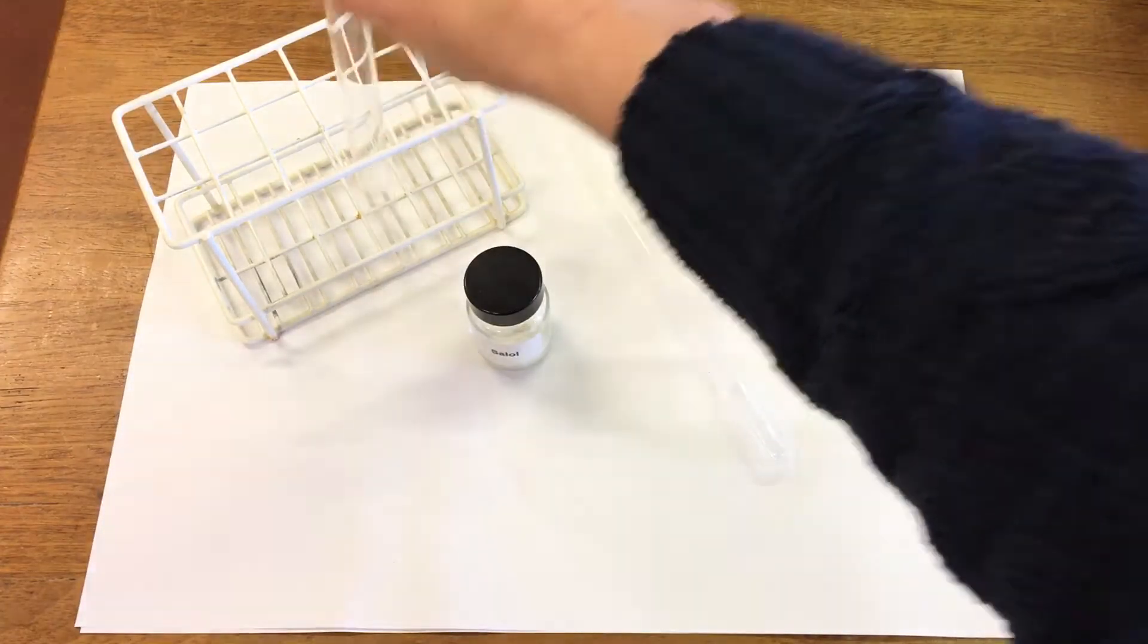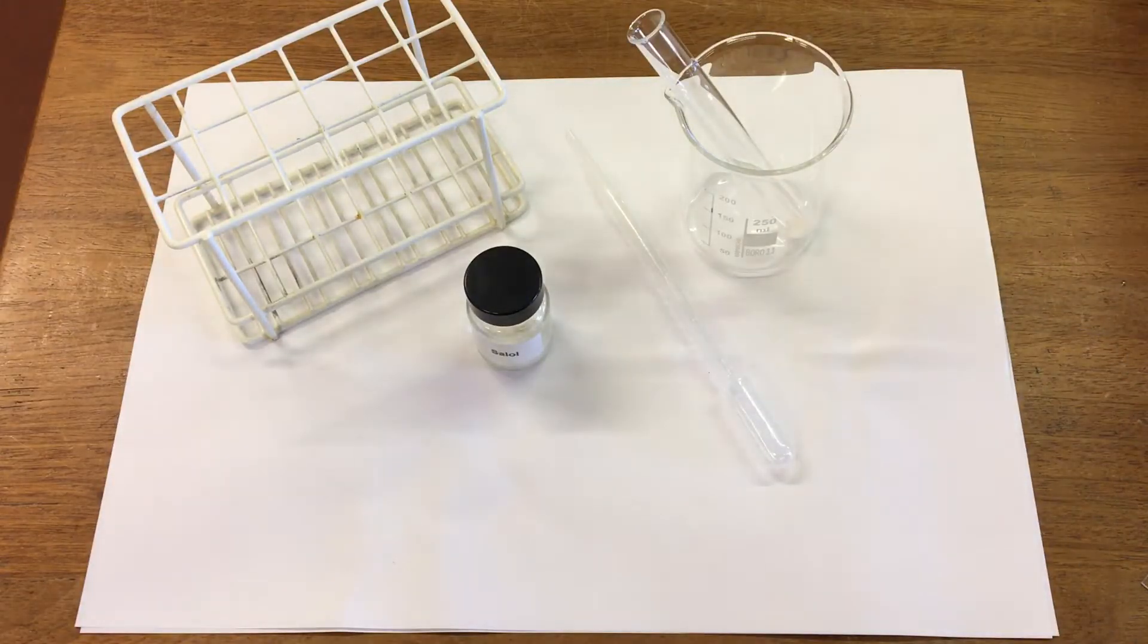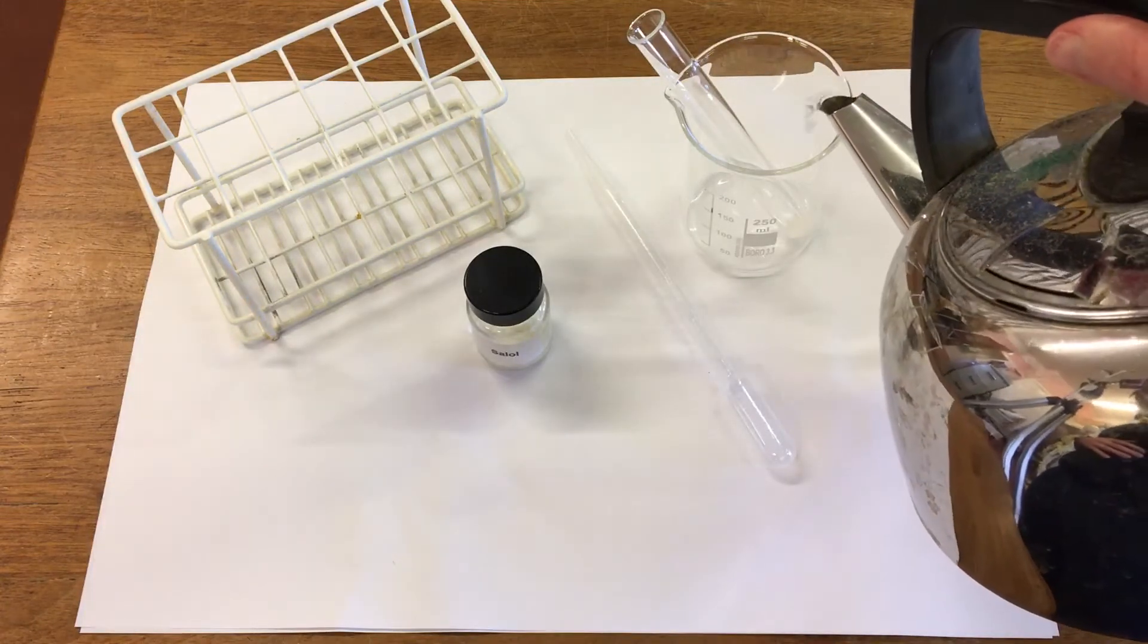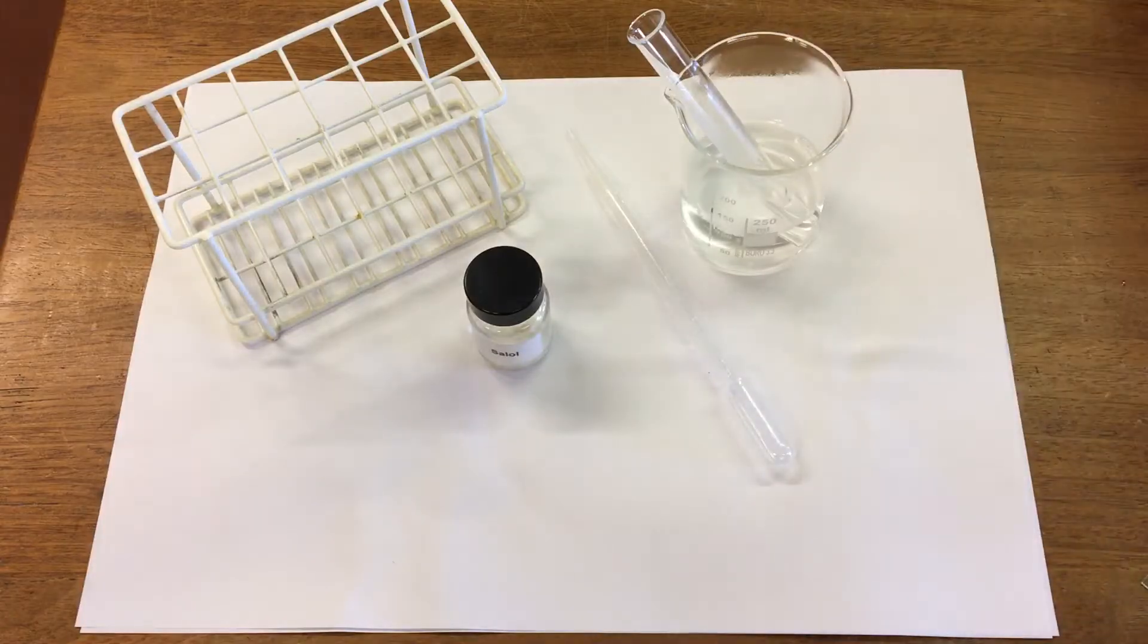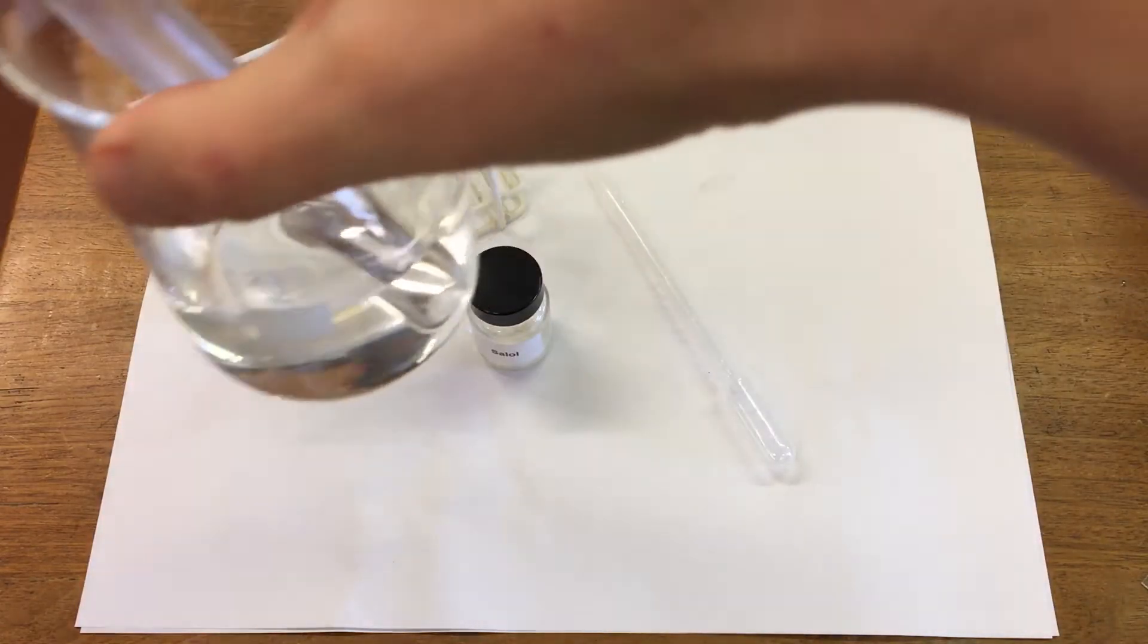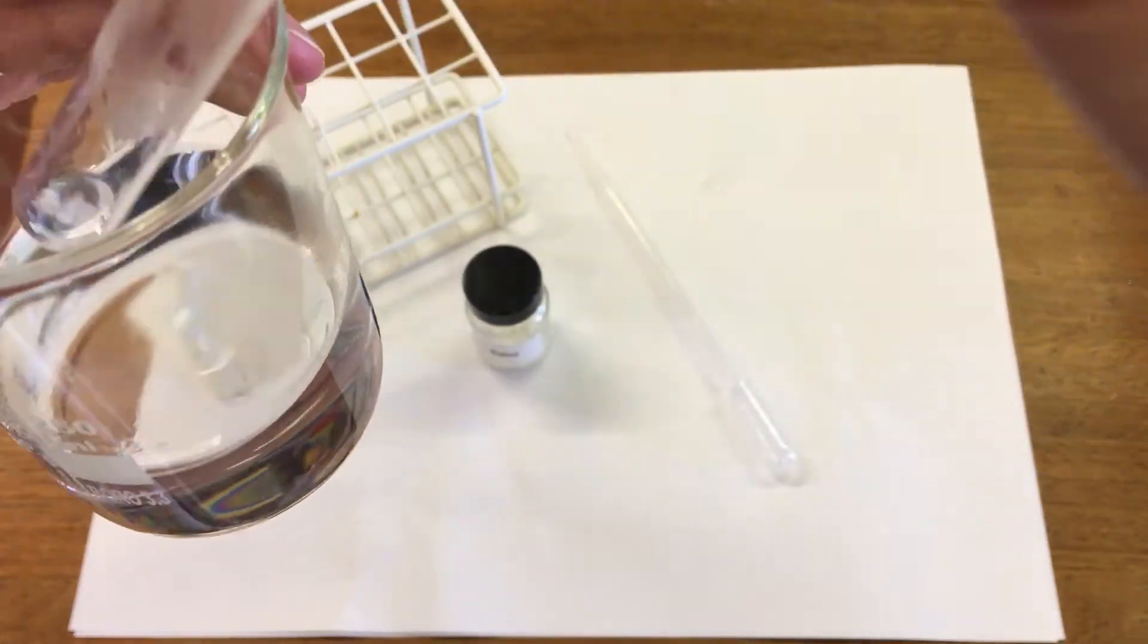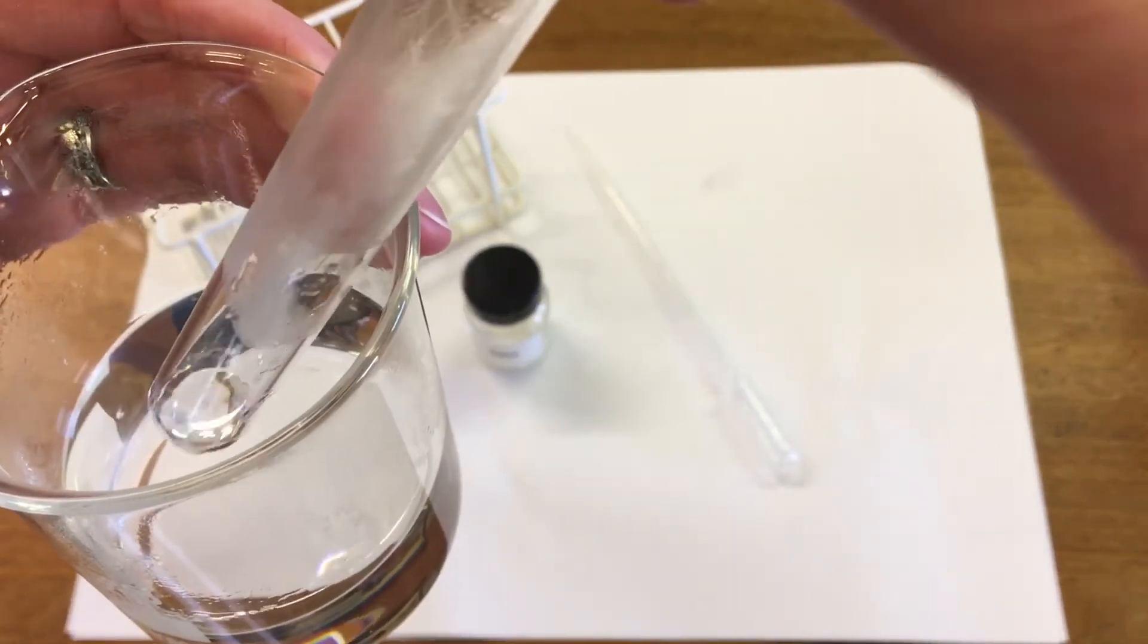So first of all we're going to put it in a beaker and we're going to add some boiling hot water from the kettle, and almost straight away you can see our white solid is starting to change into a liquid.